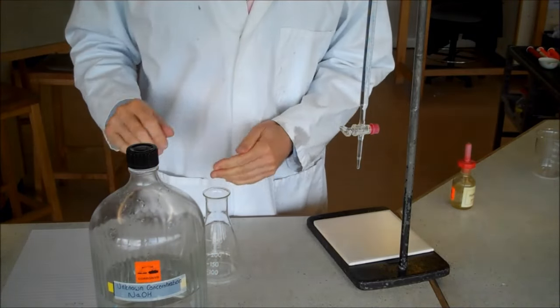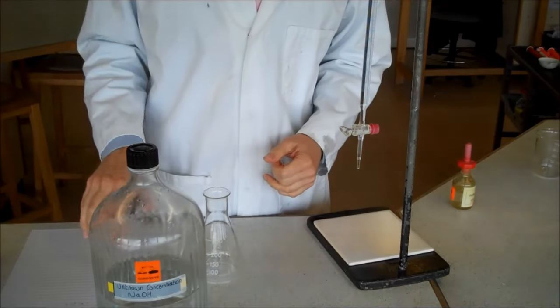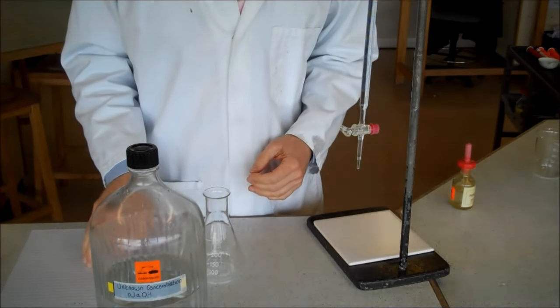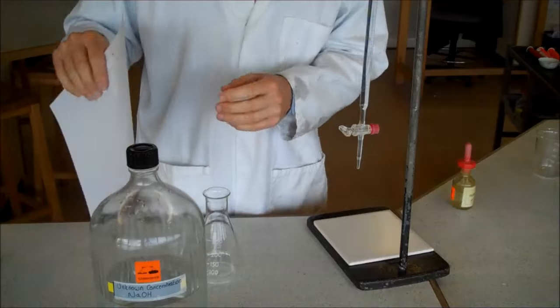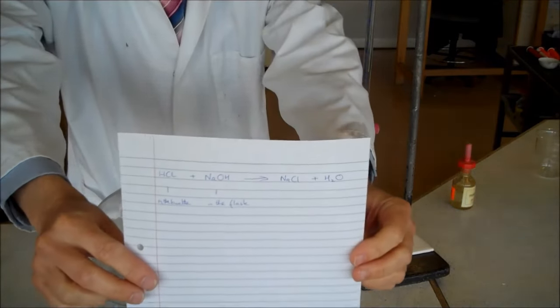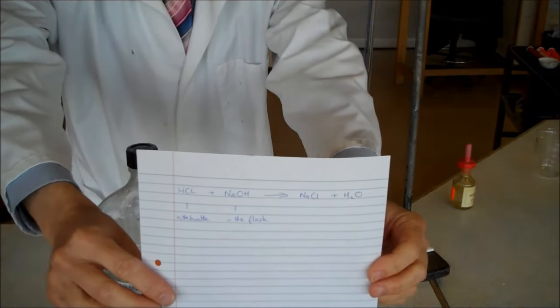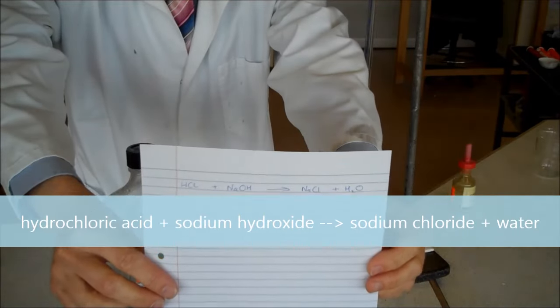This is the first step in making a salt from a soluble base, an alkali, and an acid. The reaction I'm going to do is hydrochloric acid plus sodium hydroxide. Both of those are soluble.